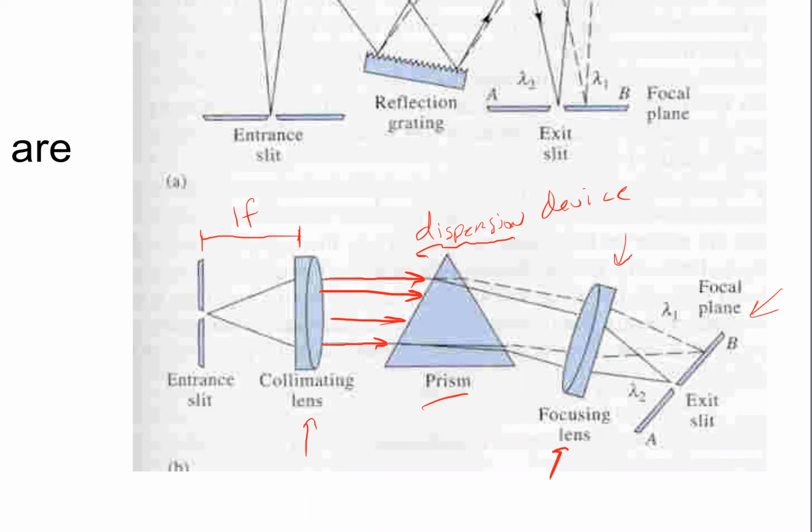And then we take a focusing lens to collect the light off of the prism, still the collimated rays. But after it passes through the focusing lens, we're going to focus the wavelengths down to specific spots. And because the prism differentially refracted our rays, the different wavelength spots will appear at different points in space on our focal plane. Okay, it's just a plane within this monochromator called the focal plane, where all the spots are focused down, basically the points.